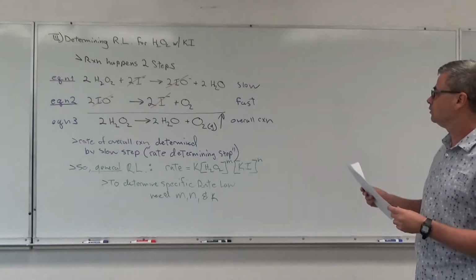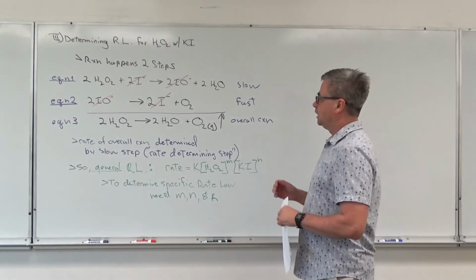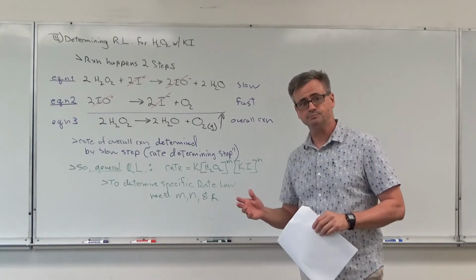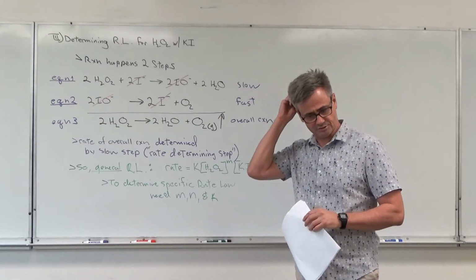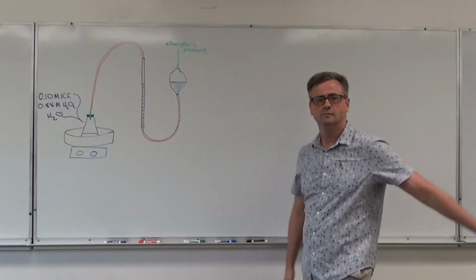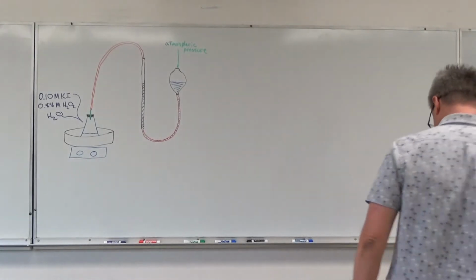All right. So before we go on, how are we going to monitor this reaction? I want to draw the setup, an artist's rendition of the setup, and show you how we're going to do it. So, voila. There's my best effort.